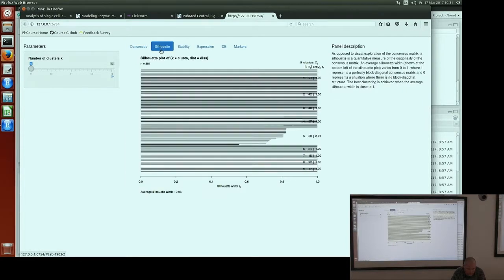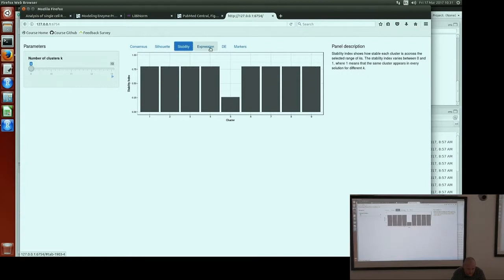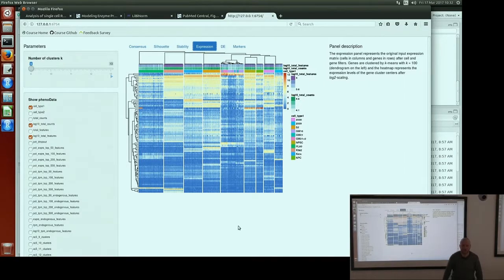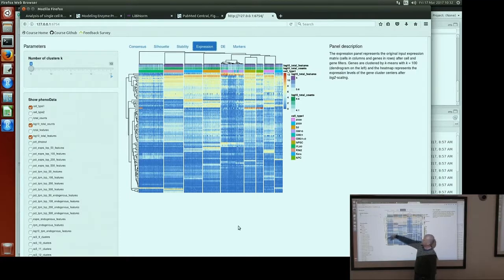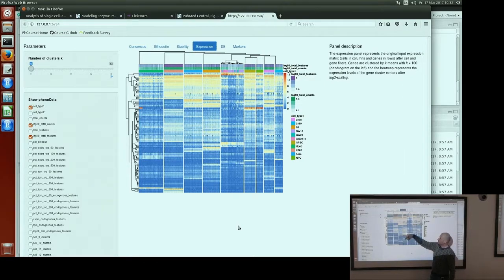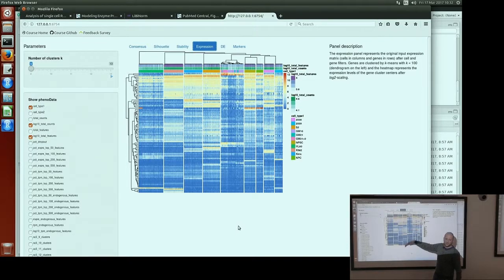Expression takes a bit of time to plot because it's a heatmap. We cluster genes to 100 clusters because it's not possible to visualize all 20,000 genes. The problem is that every time you run it, you get a different order of the clusters — so if your heatmap changes, don't be scared, it's the same heatmap, just the order of clusters changes.